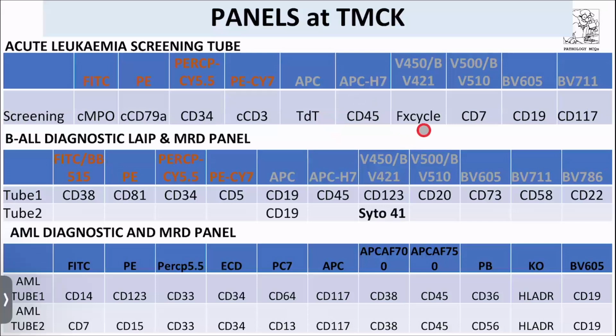Then we have FxCycle. What is FxCycle? Can anyone write in the chat box? What is the meaning of FxCycle and what is the function of FxCycle?